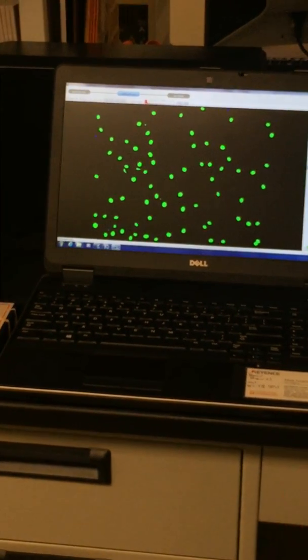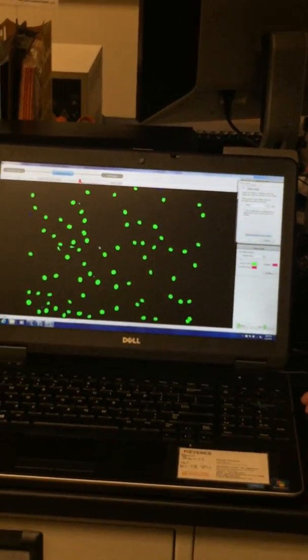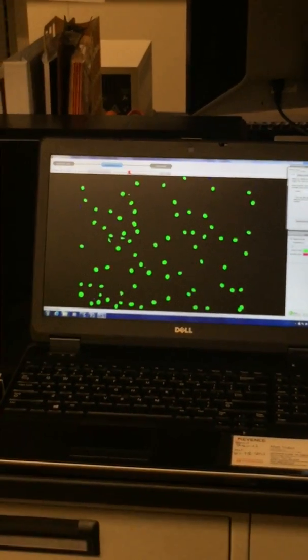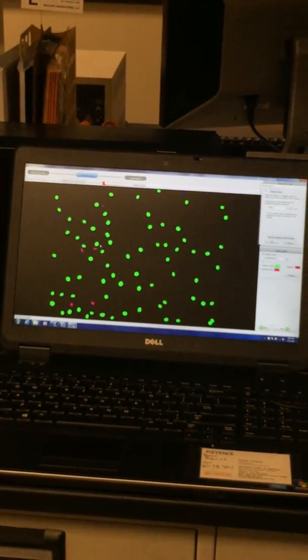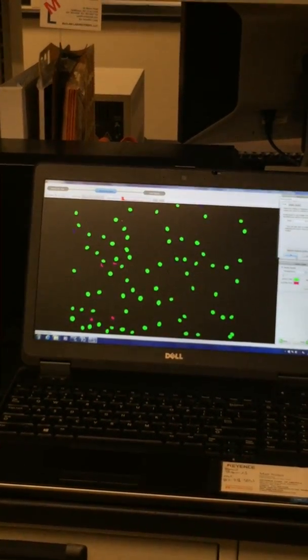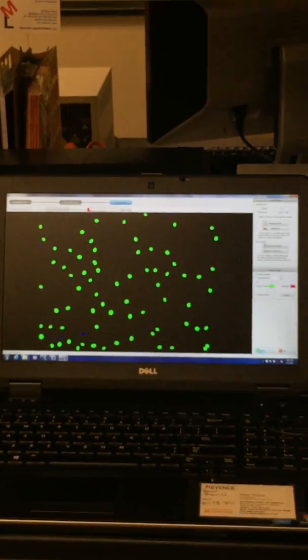Under here, if you also go back to remove unwanted areas, remove areas at the edge of screen is what I showed you, but you can also just click on any area. If I click on this little area right here, it's going to highlight this little nucleus and every other piece of artifact or debris or nucleus that has this area or smaller, and get rid of them. So then you go to next. Actually, one other thing I want to show too.